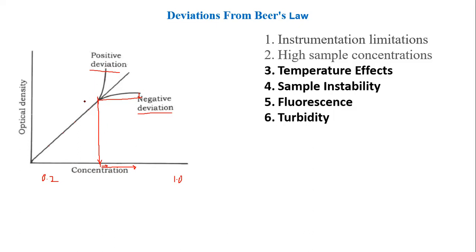That is not following Beer's law. The other way around, there is a possibility that when I increase the concentration by a large value, I expect a large change in the optical density, but it is not happening here. The change is very small. There is very small increment in absorption, although I change the concentration by a magnitude of say 100.